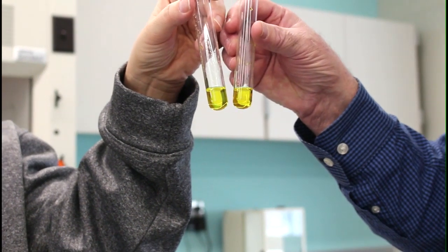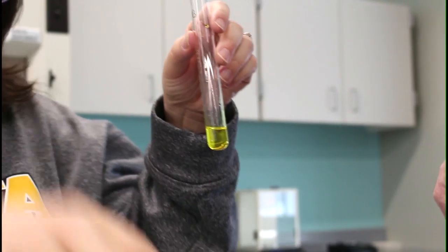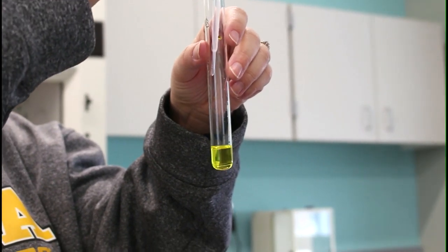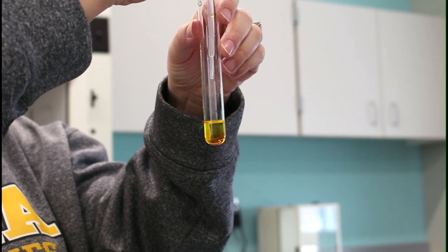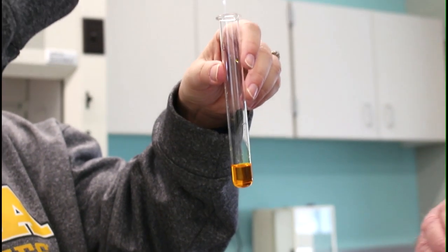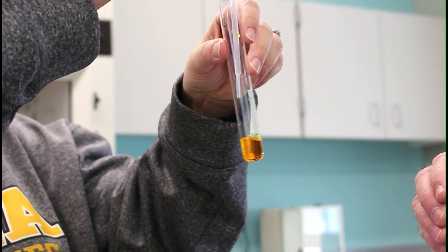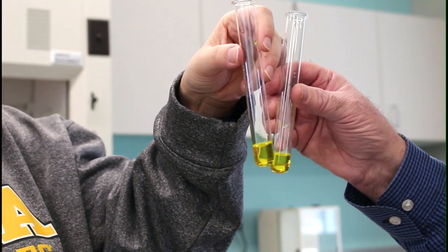Why don't you add some more of the H2SO4 to it? Let's do that. All right, so here comes some more H2SO4. What do you think is going to happen? I'm going to shift the equilibrium now to the dichromate. And now, one more time, the NaOH. So it's going to go from orange dichromate to yellow chromate. We could do that again and again, but I think that's enough.